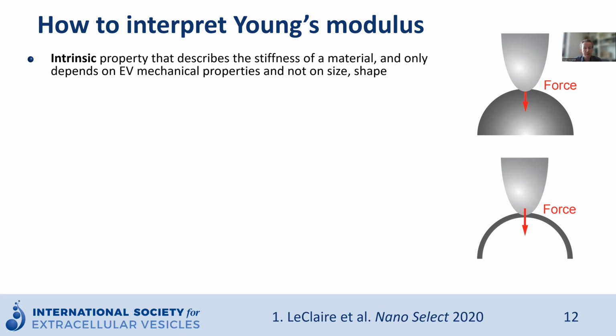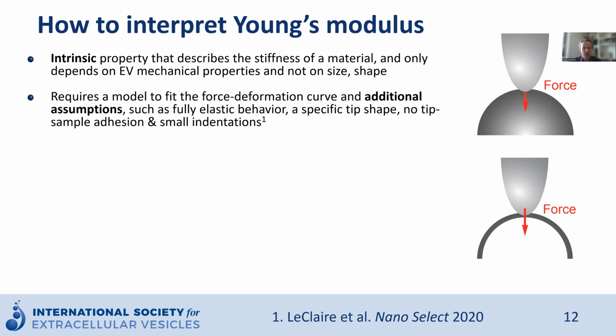So these parameters are also obtained by fitting the force deformation curves, but the formula depends on the chosen mechanical model. And this often involves additional assumptions about the particle property.